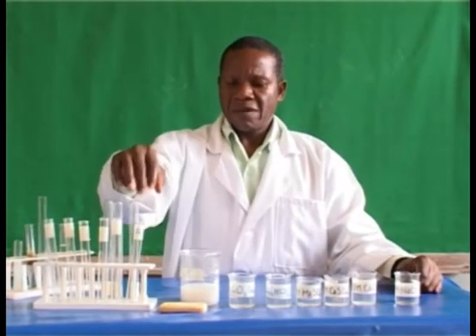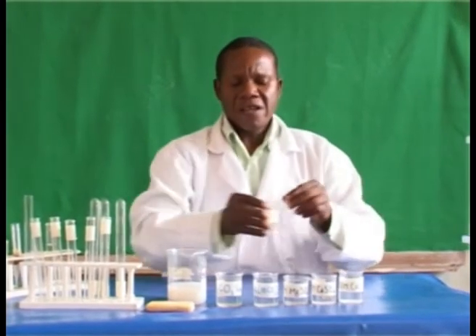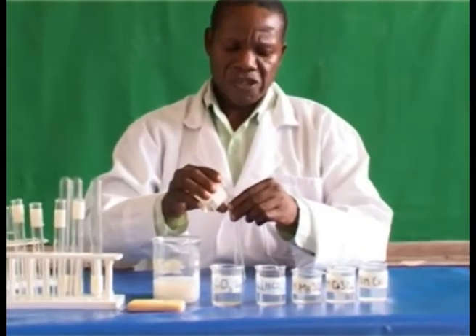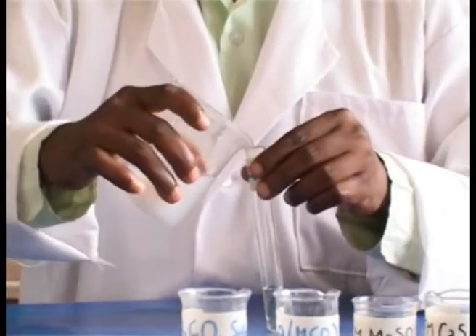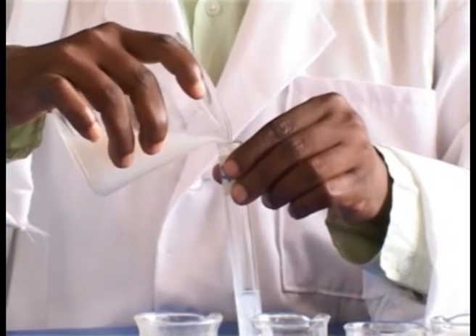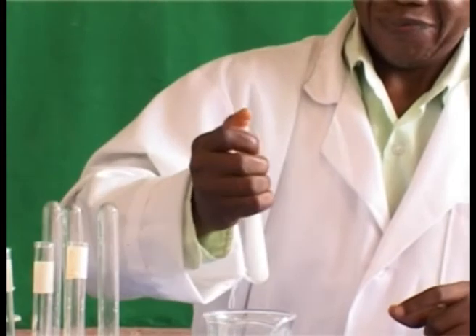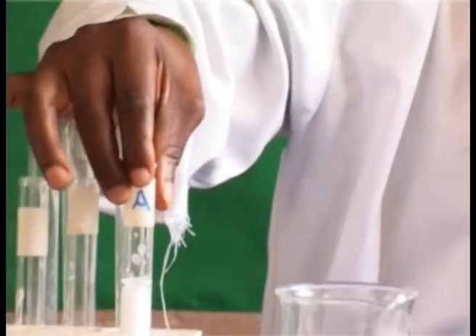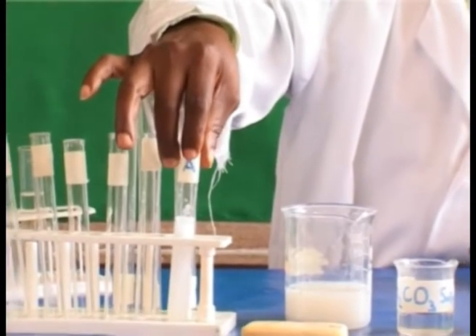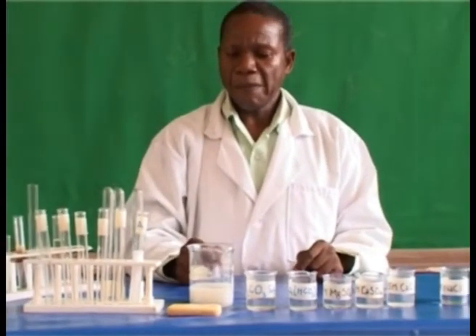Procedure: take test tube A, put a small amount of the prepared sodium chloride solution, and then add a small amount of soap solution. Check if it will form lather or not. So lather is formed, and then let us wait for other observations.